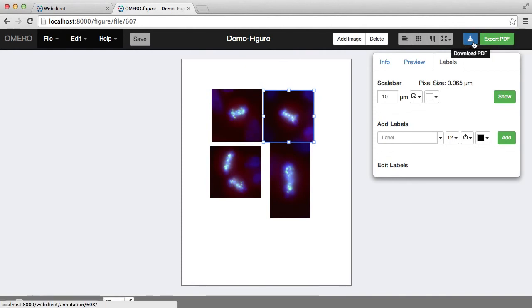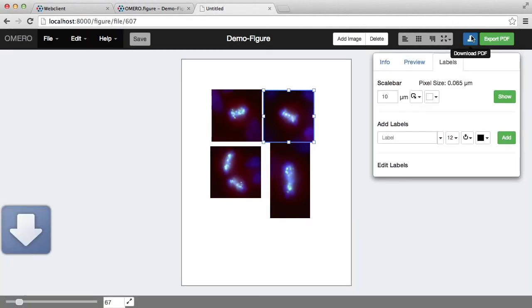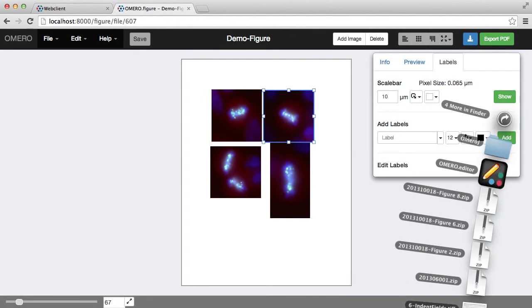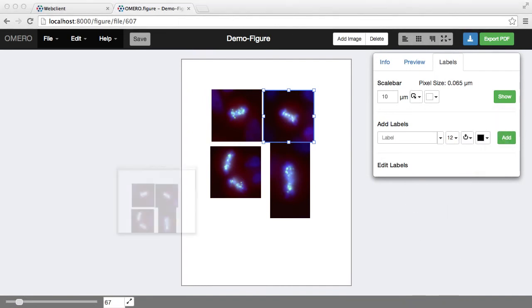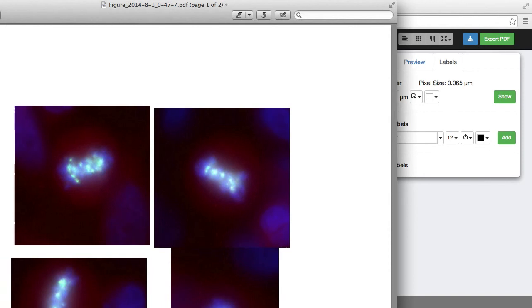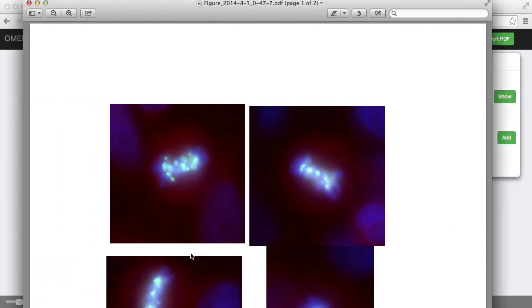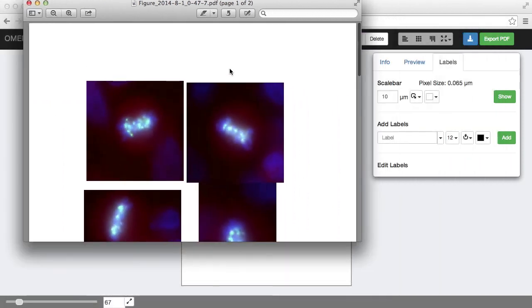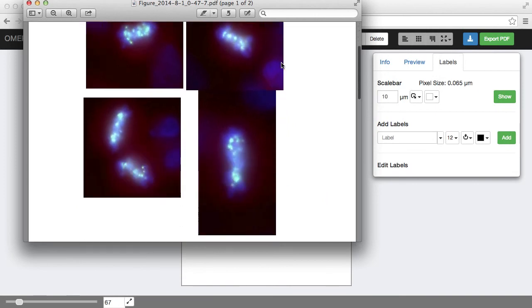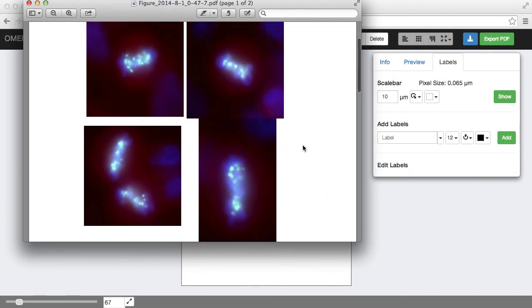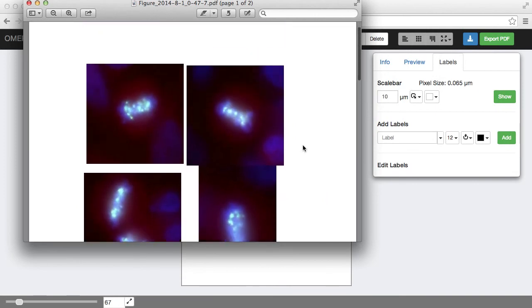This has created a PDF which is then available for me to download. And I can continue editing that PDF in another package such as Illustrator.